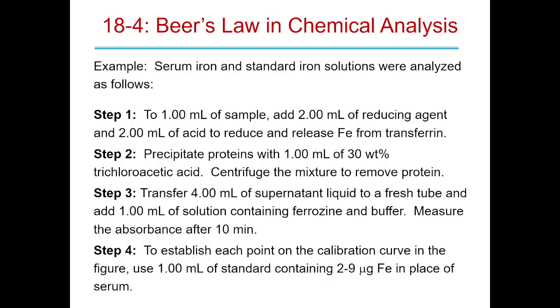I don't remember. I think their instrument is so good now, because with Raman spectroscopy, you can really get so good on one instrument that measures so fast. By the way, that thing measures thousands of samples a second. Literally, you can't even see the individual bottles.